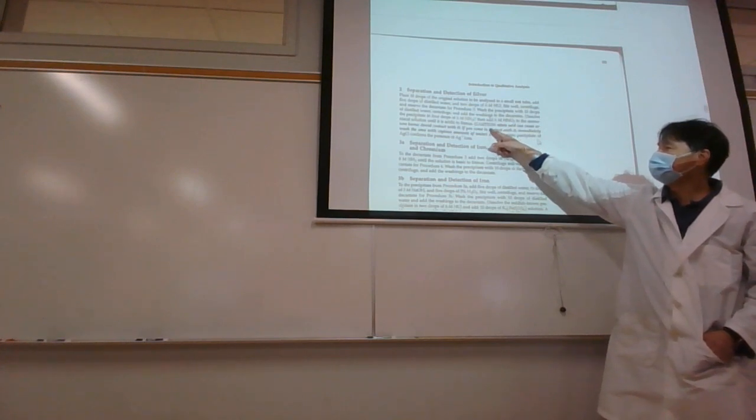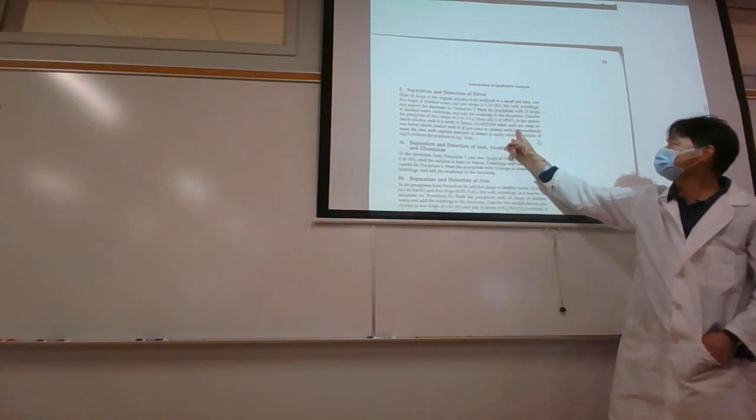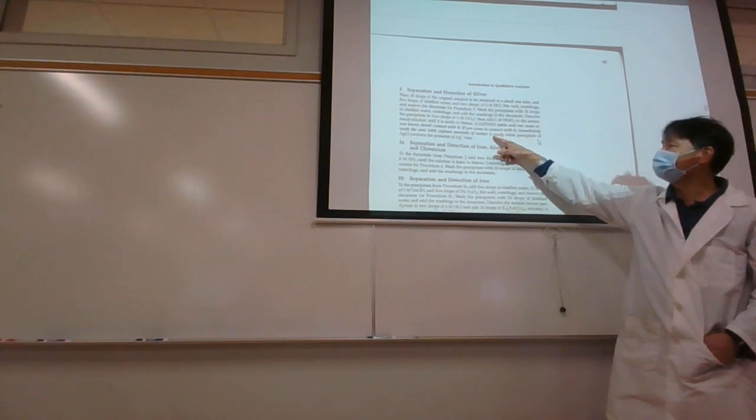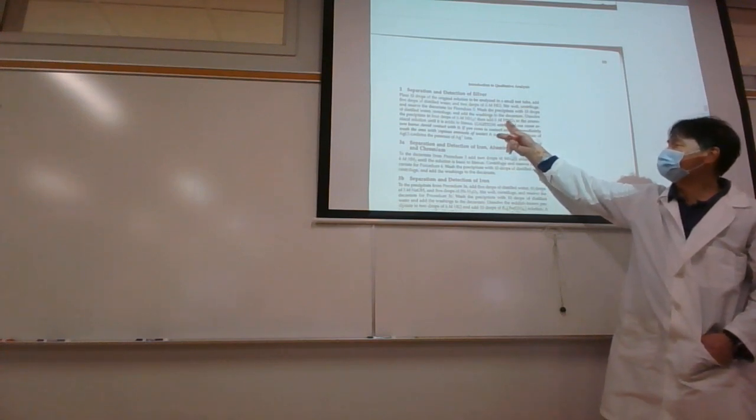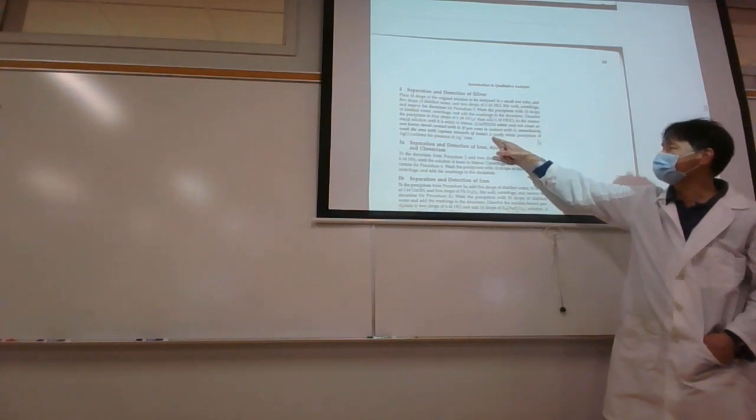There's a caution here. Caution, nitric acid can cause severe burns. Avoid contact with it. If you come in contact with it, immediately wash the area with copious amounts of water. What about HCl? HCl does cause burns, but not as severe as nitric acid. Nitric acid is an oxidizing acid.